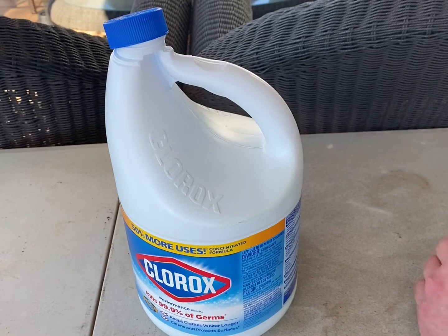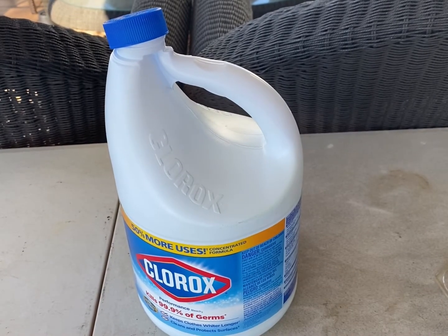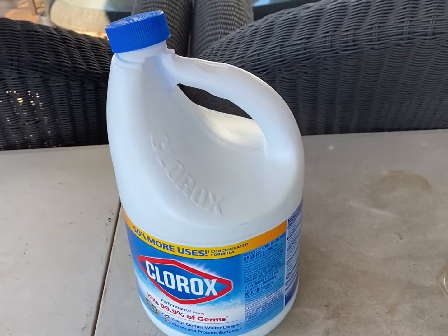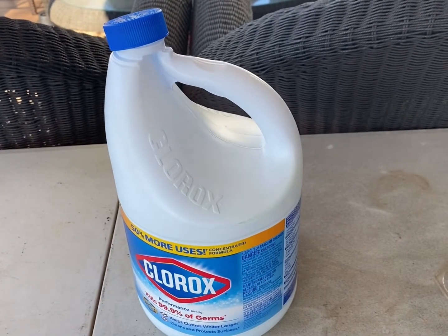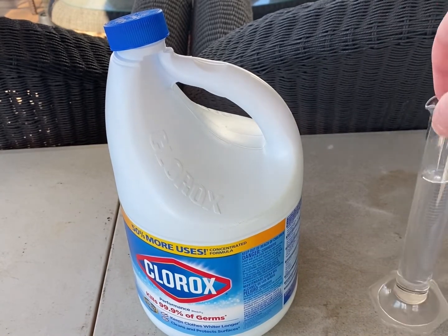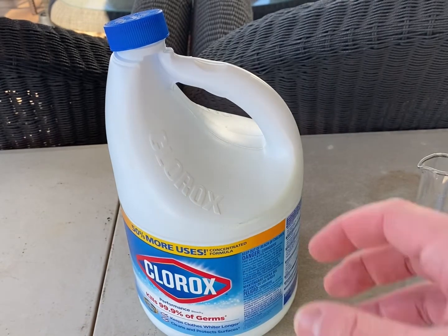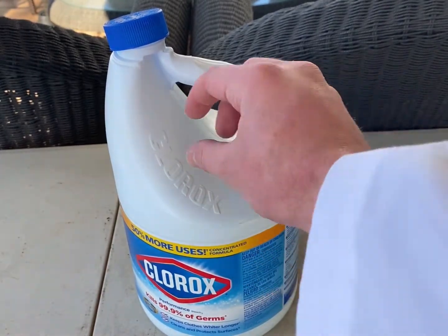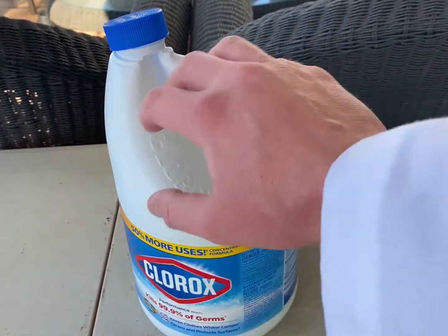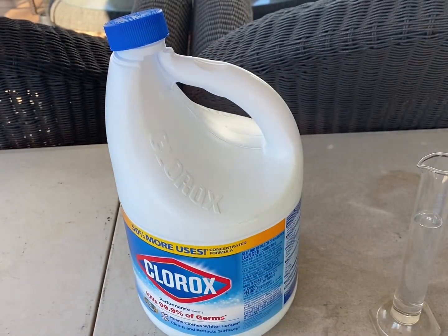In about 30 minutes, after the acetone is all done reacting in the bleach solution, I will add the rest and shake again, and then we're gonna let this sit overnight, because what's gonna happen is the chloroform is gonna form in little globules. It's gonna be all throughout the solution, so we're gonna wait and let it fall to the bottom.